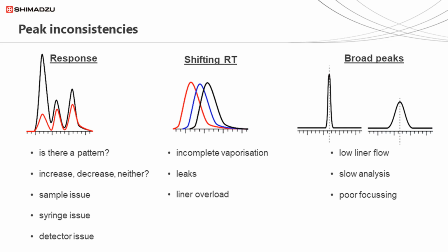Peak width can sometimes be a problem if it is too broad. Wider peaks give less consistent integration and so poorer results. Broad peaks can occur either because a peak has spent too long diffusing in the column or because it was not focused correctly in the inlet. If the method is slow, consider raising the temperature and column flow to sharpen the peak. If using a splitless injection, ensure the solvent focusing step has been performed correctly.